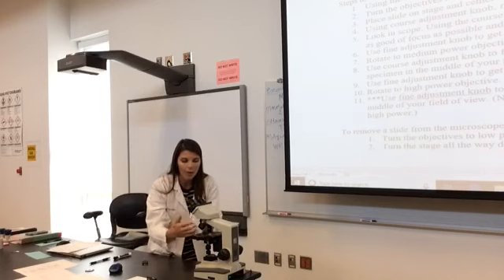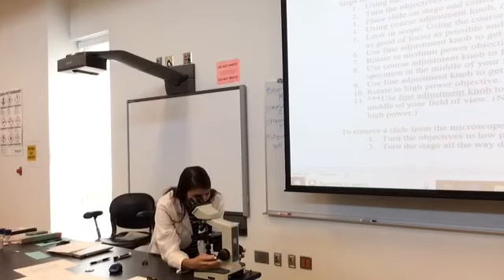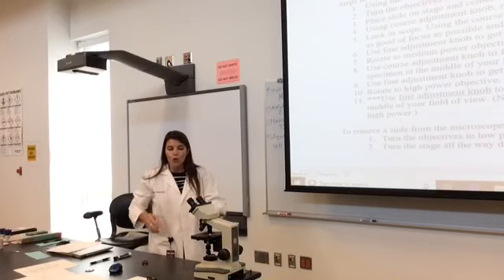From medium power, I'm going to go from here to high power while I'm watching it. It is not focused, but I can tell something's there. I'm going to use my fine focus, and there it is. I personally move it towards the middle, especially if I'm going to be evaluated on it, so that the professor has no option but to look at whatever. It's not like off in the corner. Okay? You have to get it to high power, which is the 40.